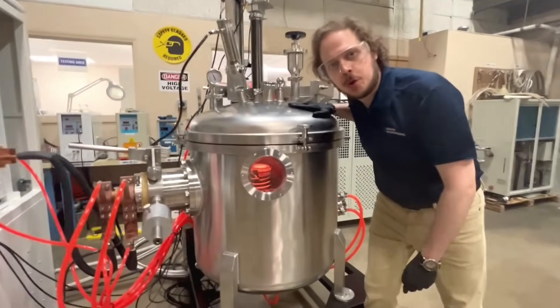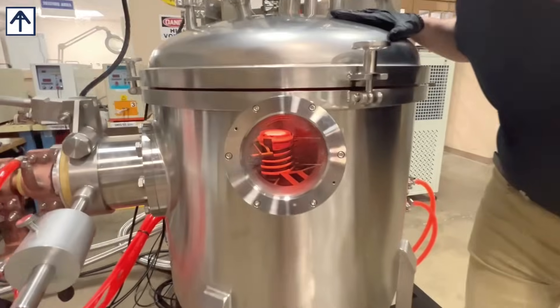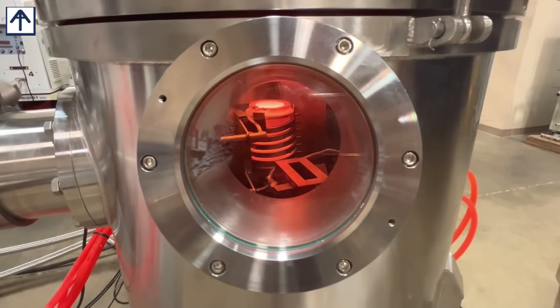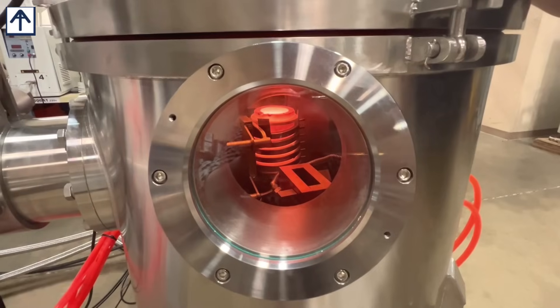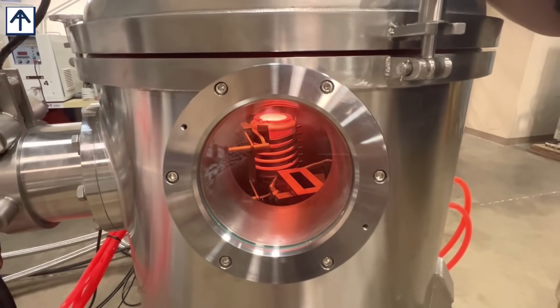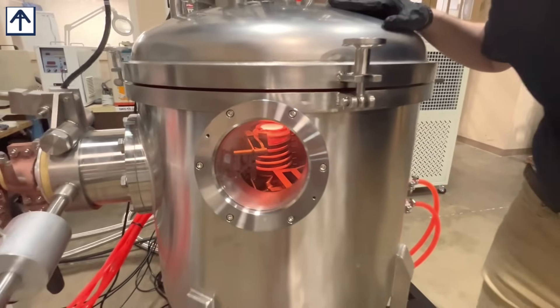Take a look inside our DIF2000 induction melting heater, which uses a 45 kilowatt power source to use either a 10 kilogram graphite, silica, or magnesium oxide crucible, and your choice of either water-cooled or preheated molds.